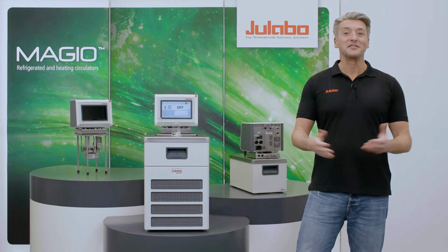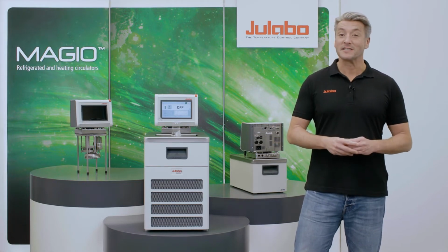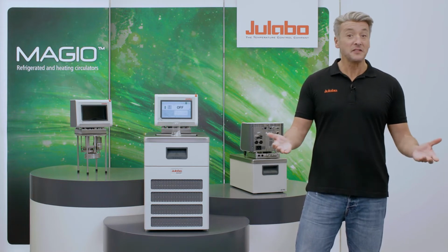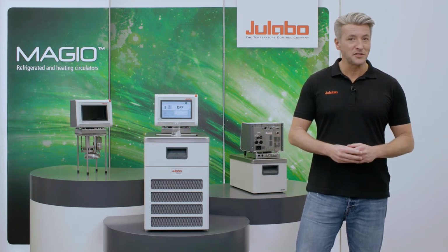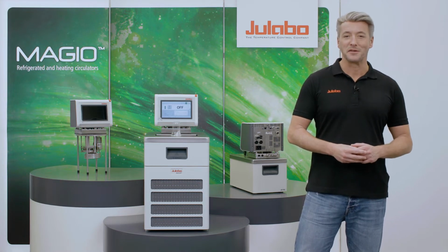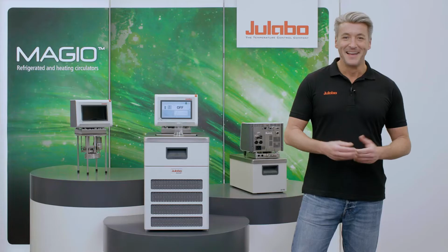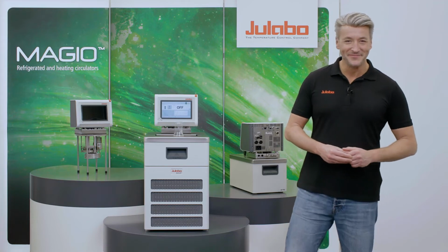My name is Alex and today I will show you the simple steps to adjust temperature sensor calibration with our Magio circulators. This feature is called ATC function, which stands for Absolute Temperature Control. For various reasons, you can obtain a slight temperature difference between the temperature sensor in the Magio and a defined point inside the bath. To compensate for this difference, you can use the ATC function. Let's see together how that works.